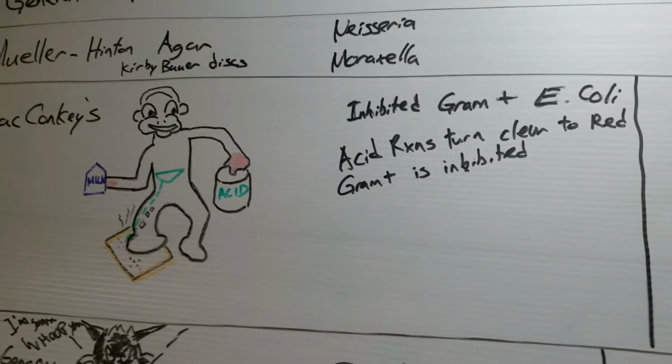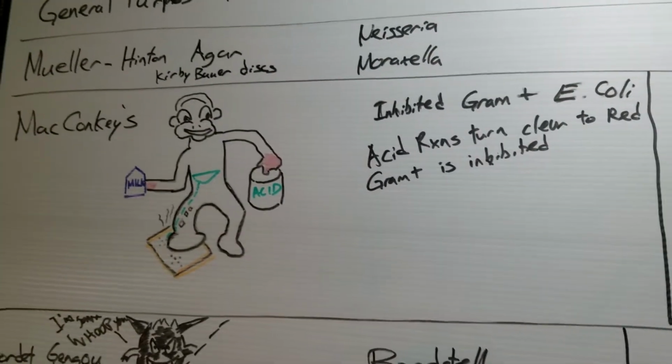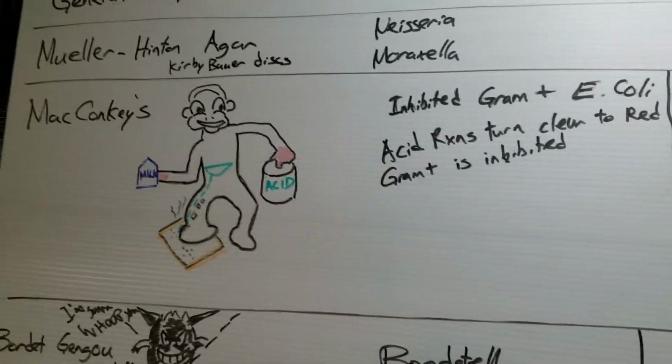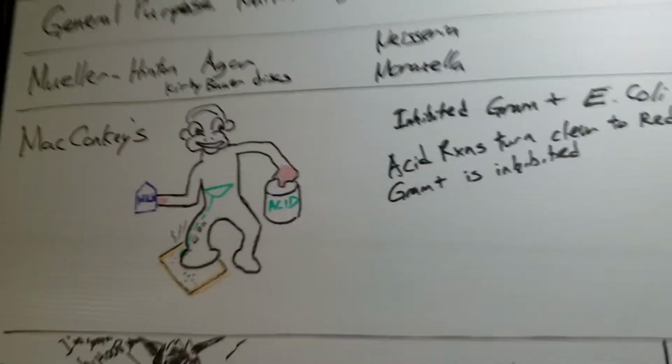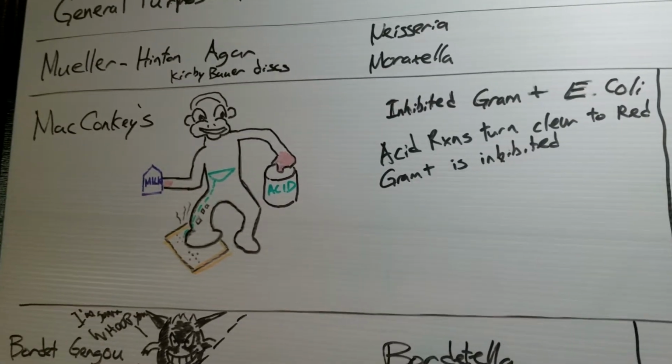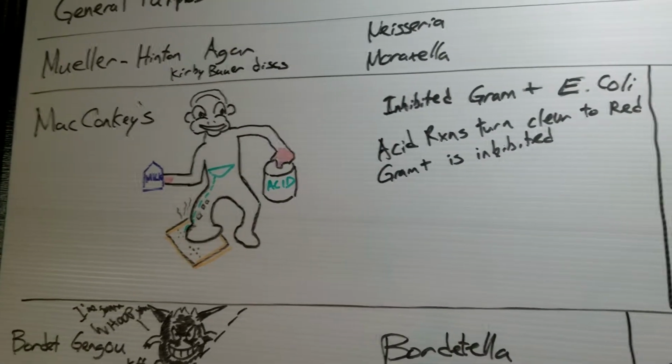So let's move to the next one, MacConkey. If you take out the ACC, macaques, you think about monkey. It almost sounds like monkey if you say macaques fast, monkeys, right? So what does macaques do? Okay, well actually, let's get to it.